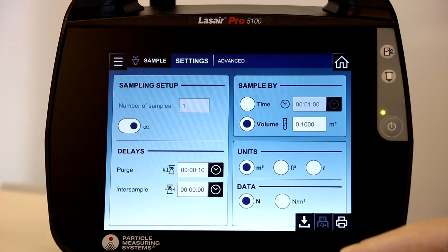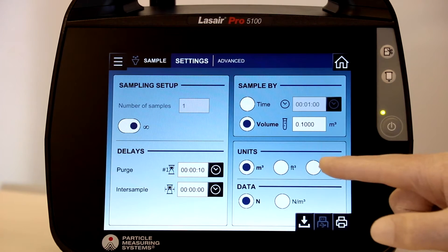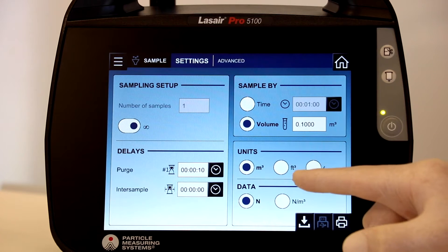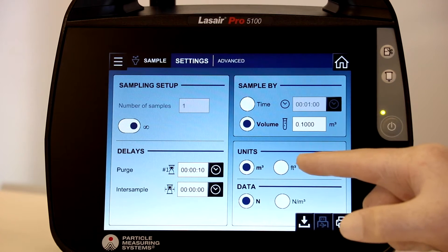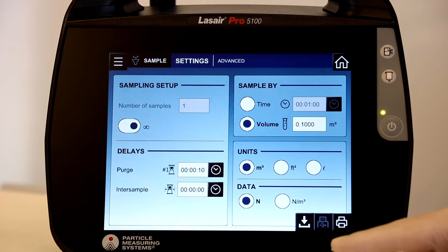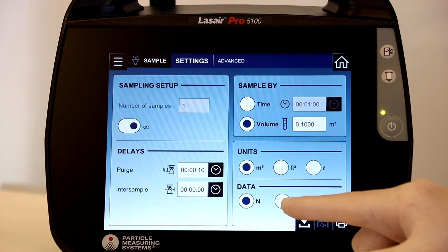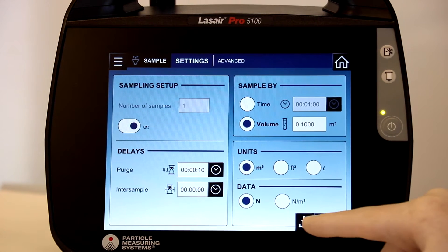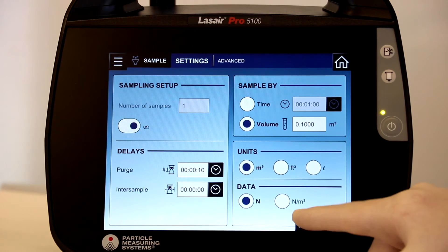Finally, you can adjust units of measurements, including cubic meters, cubic feet, or liters, and set the data reporting to raw counts or normalized counts per unit of measure.